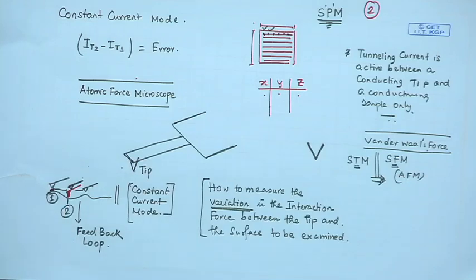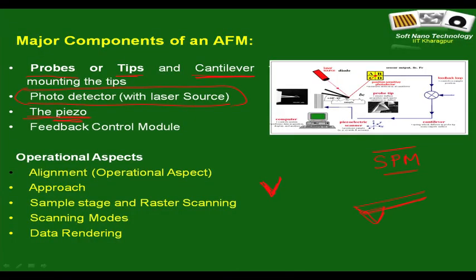And you typically control this by a piezoelectric scanner, which has a piezoelectric material. Please do check what is a piezoelectric material. Put very simply, a piezoelectric material is something to which if you give a deformation, it will produce some current, or if you apply a bias to a piezoelectric material, it will change its size.